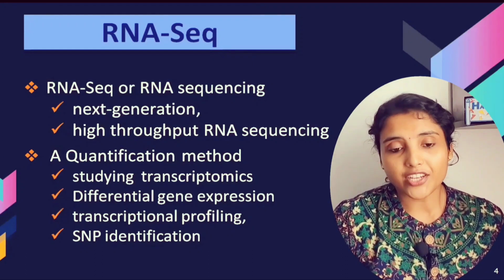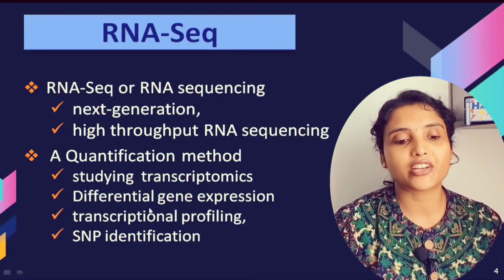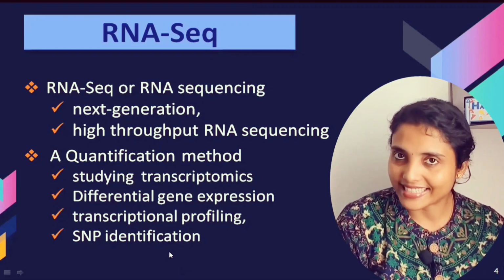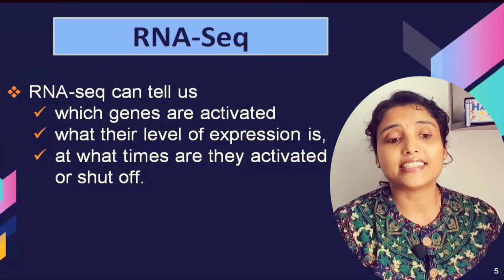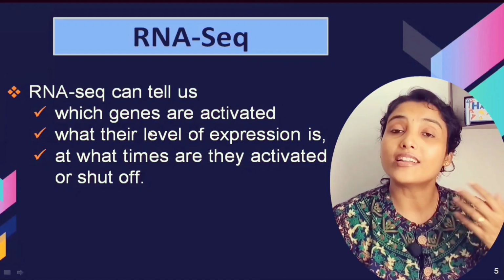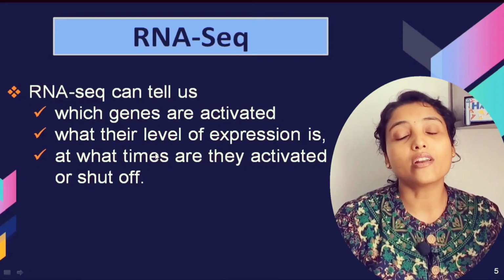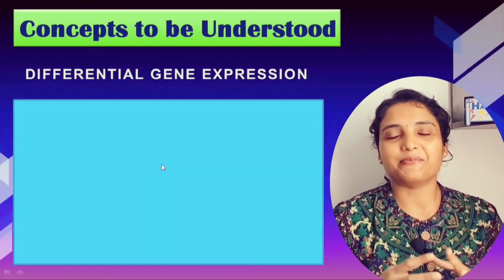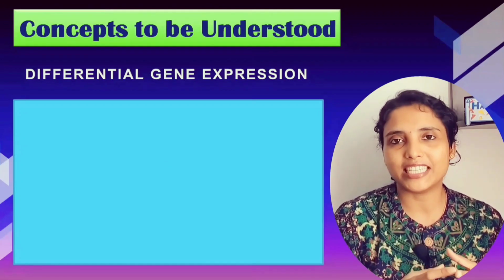It's also a quantification method, which is used in the study of transcriptomics, differential gene expression, transcriptional profiling, and single nucleotide polymorphism identification. Okay. RNA-seq can tell us which genes are activated, what their level of expression is, and at what times they are activated or shut off. We'll be going into the detail. Do not worry.